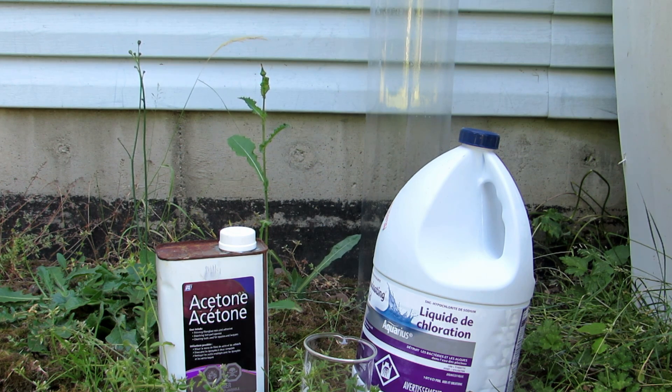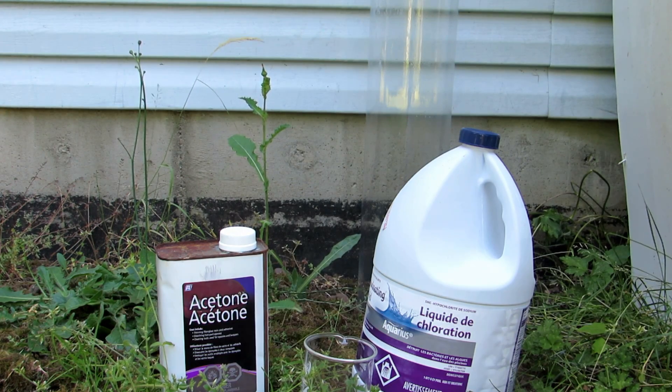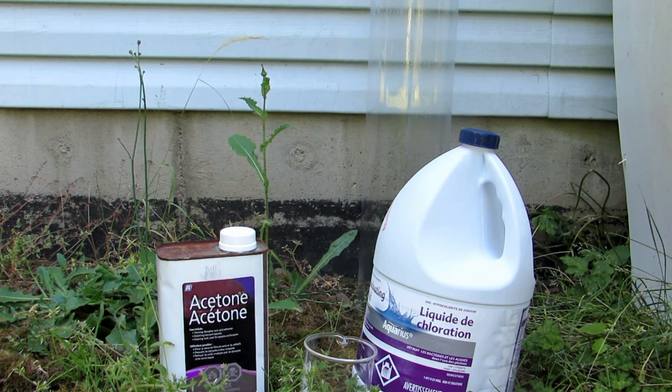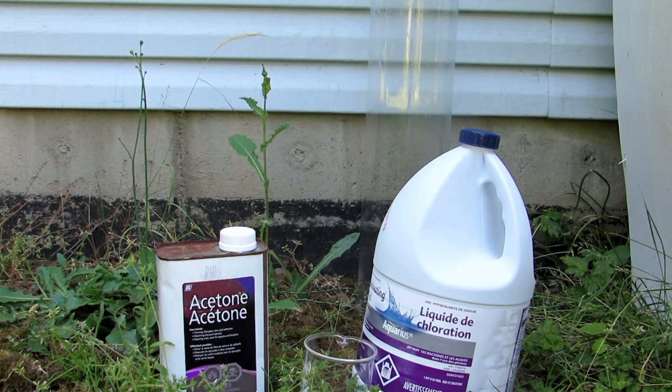This is very simple to actually produce. We just need some sodium hypochlorite solution and some acetone. Sodium hypochlorite solution can be purchased as bleach or extra strength bleach, which is just a higher concentration, or this chlorinating liquid which I purchased at Canadian Tire. It was $10 for 5 liters, and it is 10.8% concentrated — the highest concentration I could find. So this is what we will be using today, as it will probably be the most ideal just due to the higher concentration, so I'll be able to get lots of it, hopefully.